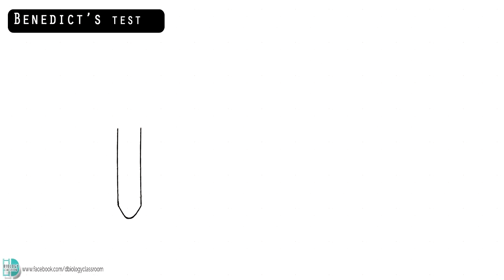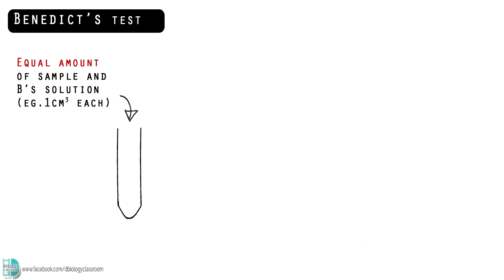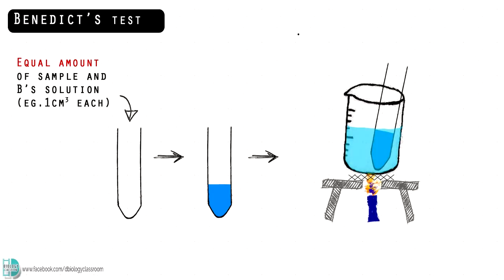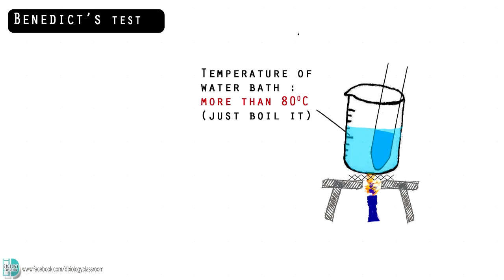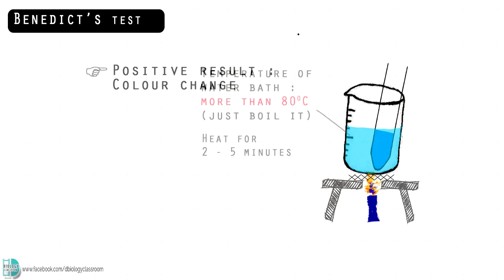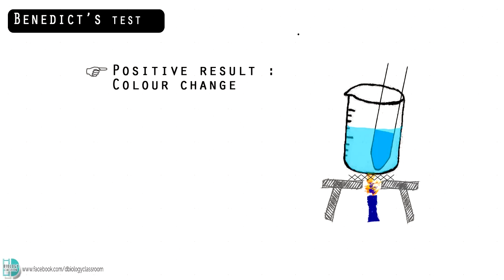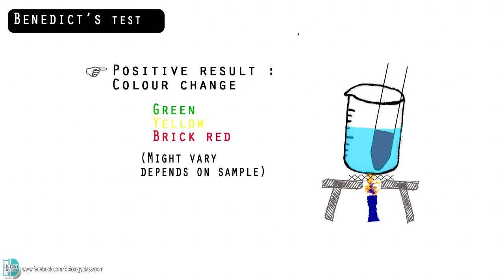First, add equal amounts of sample and Benedict's solution into a test tube. Shake to mix the solutions and then place the test tube into a water bath. Make sure the water bath is more than 80 degrees Celsius — a boiling water bath is good for the test. Heat the solution for 2–5 minutes. The initial blue coloration of the mixture will turn green, then yellowish, and may finally form a brick-red precipitate.